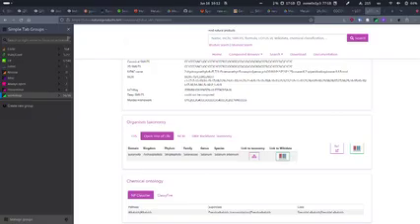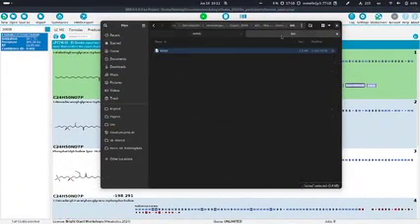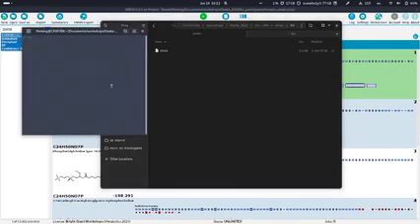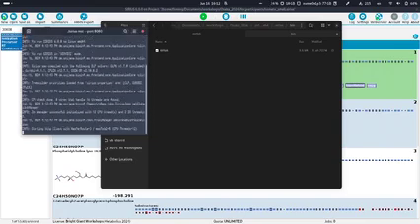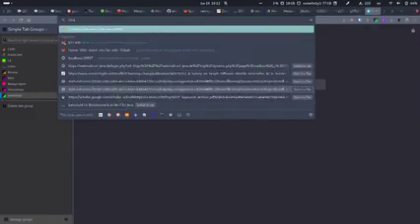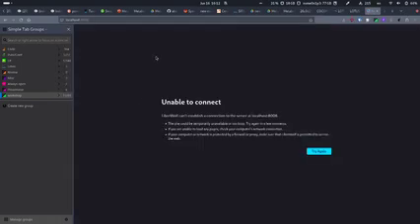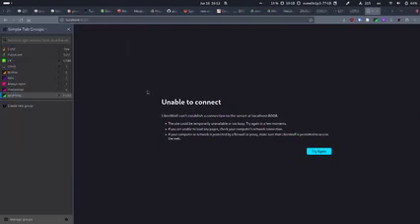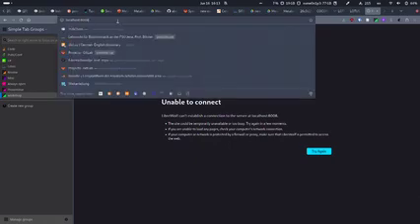But if we then sort them by confidence, they would have a really low confidence and would go down in the list. And so if you sort your list by confidence score, you would miss these candidates where the correct answer is known, but you cannot distinguish between 2 super similar structures. So that's why we now have this approximate mode, which just means we are confident that our annotation is correct, but we cannot distinguish the top 2 answers, for example.